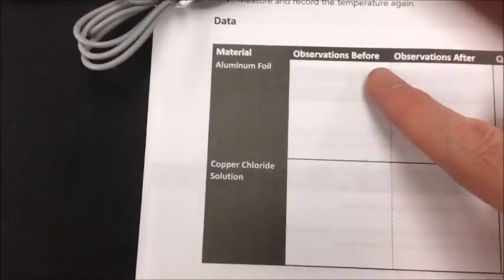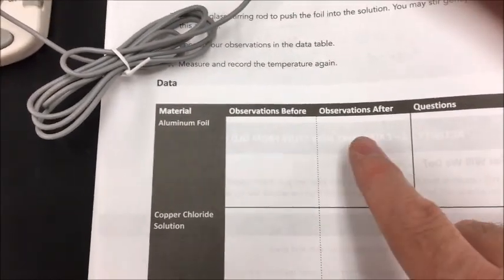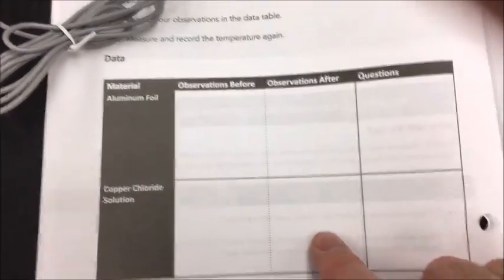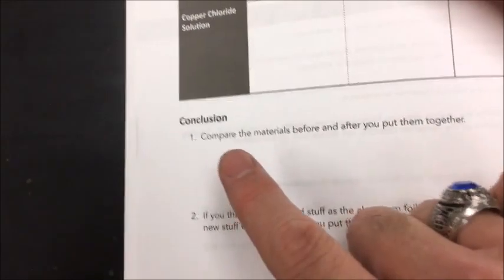So you've already made your observation notes of the aluminum foil and the copper chloride prior to adding them together. Now I want you to write your observations of what you see happening to both of these after they have been added together. Put any questions that you have about this interaction in these boxes here, and then you're going to answer these questions.